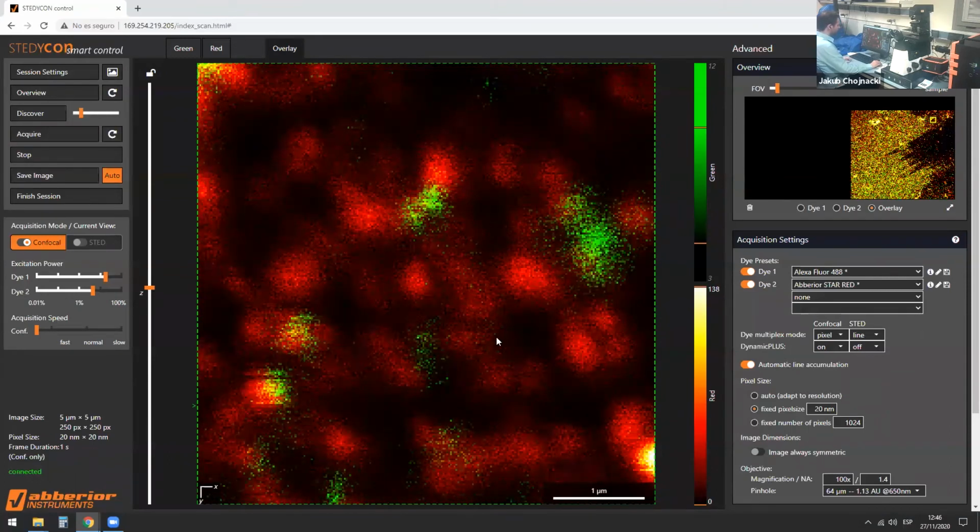But you do not have that much information about the position of the orange dye, of the orange color, which is the position of individual surface proteins. And this is exactly what I was talking about. This is the weakness or limitation of fluorescence microscopy. Anything that is smaller than 250 nanometers will appear as a large blob. And so precisely those proteins that we have labeled on the surface of virus particles appear as large blobs. But now, let's see what happens when we use super-resolution microscopy.